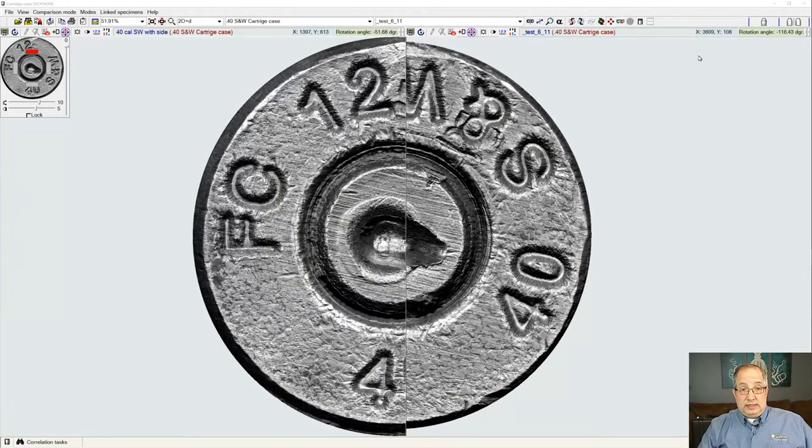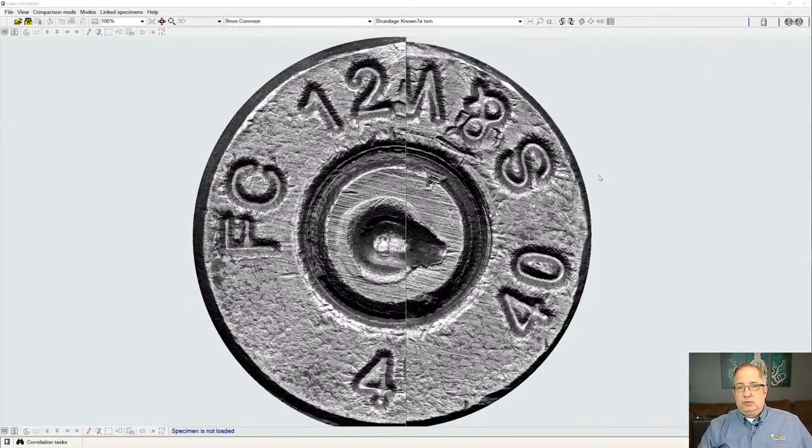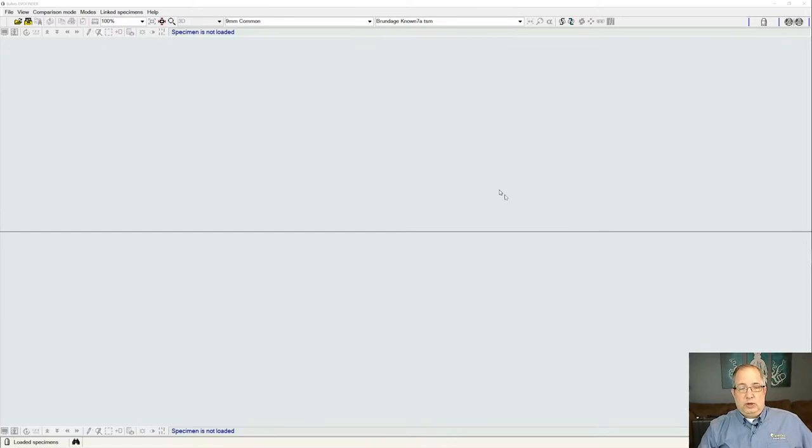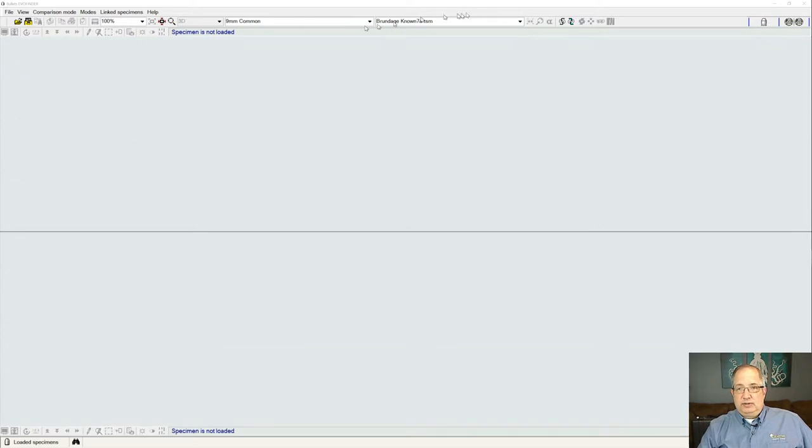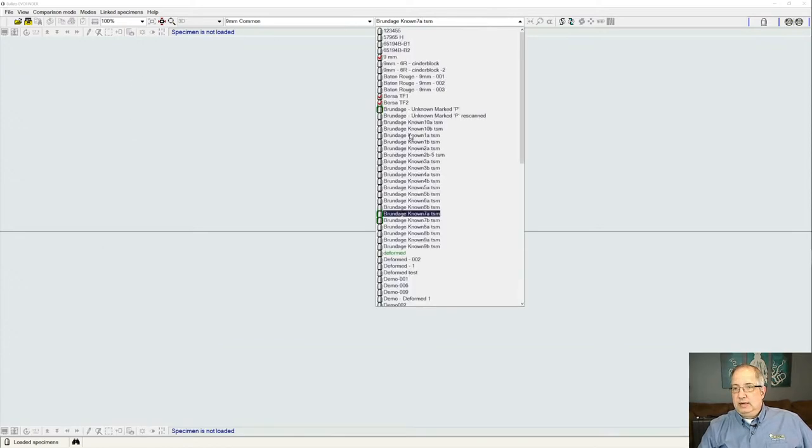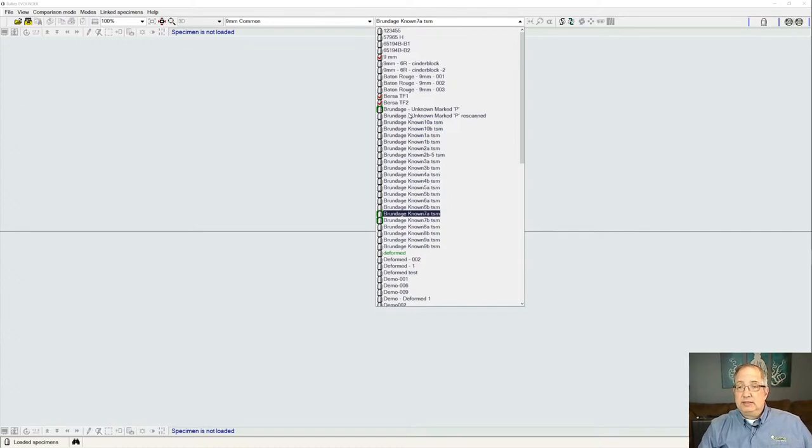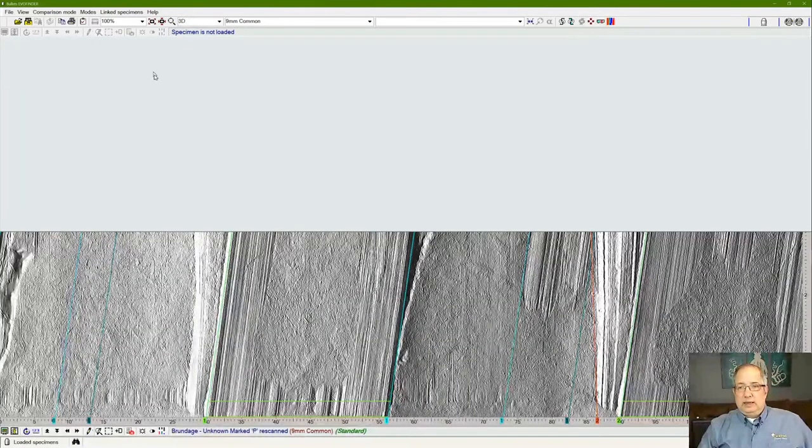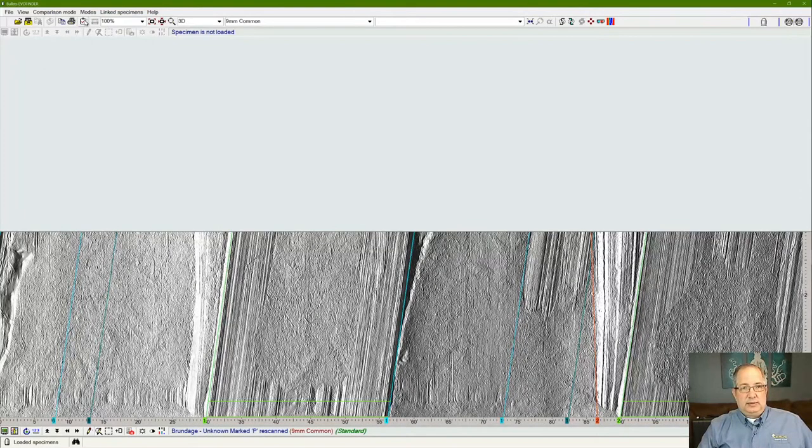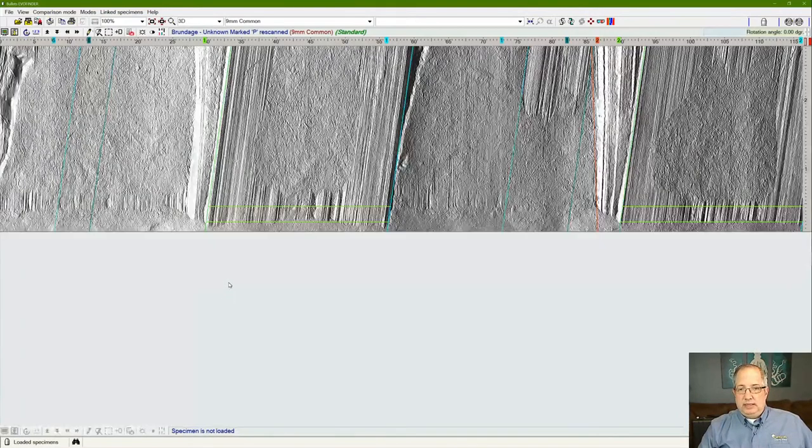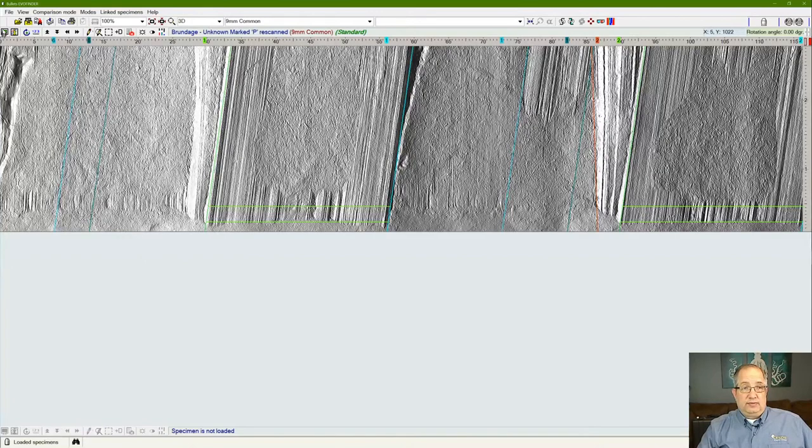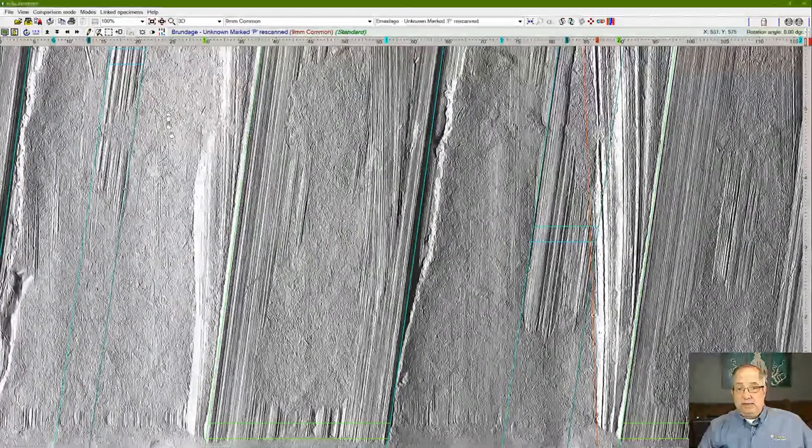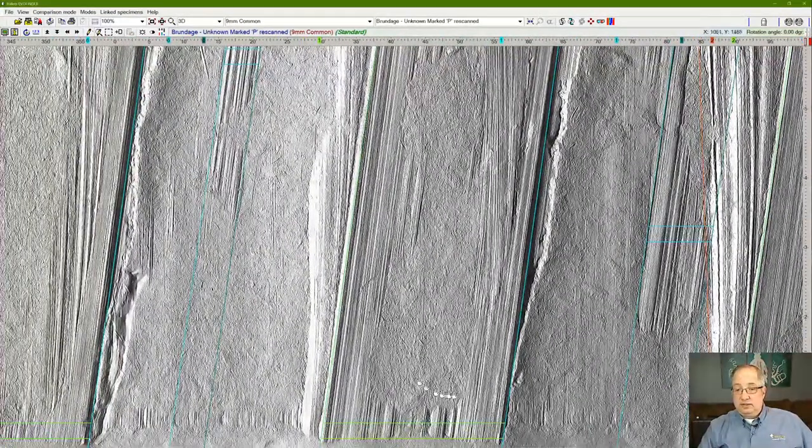Going over to the bullet side of this, looking at bullets, we have a very similar perspective where we can have one or two samples set up side by side. Also, bringing them in from our search results, we can view them in tandem from the sample under examination and the similar sample that came up on the results. What I'm bringing up right now is one of the bullet samples from a Brundage set that had been run previously.